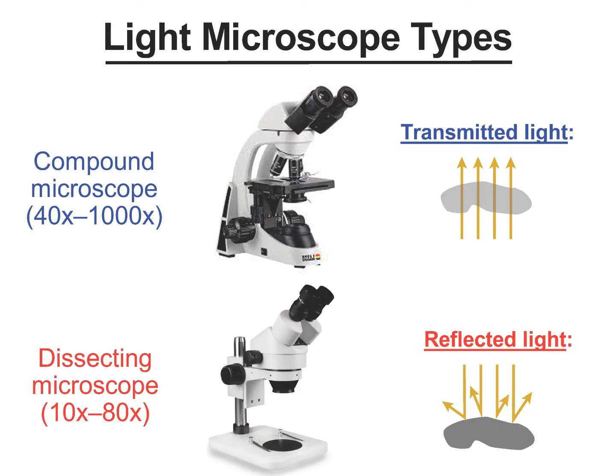The other type of light microscope is called a dissecting or stereo microscope. These have a more limited range of magnification and usually rely on light being reflected off objects, and then that light proceeds through lenses to the eye. As we will see later, scanning electron microscopes produce images in a radically different and quite ingenious way.